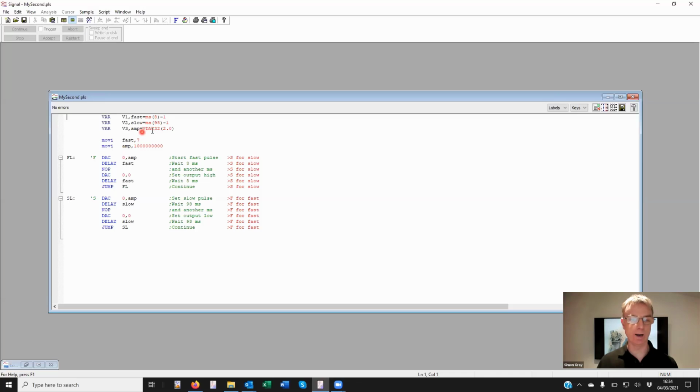We've got a new macro here, VDAC32. If you're setting the DAC using a number you type in, then the DAC scaling comes into play, and you can type a number in whatever units you define for that DAC. If you're using a variable, then you're into a different scenario. It's not just a case of the integer stored in the variable is the amplitude you want to output.